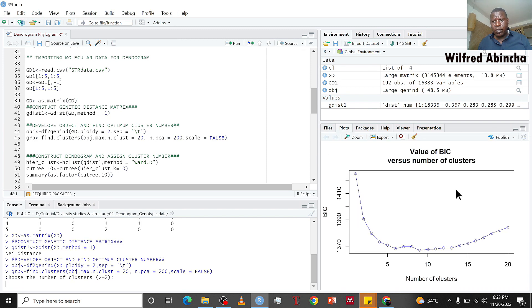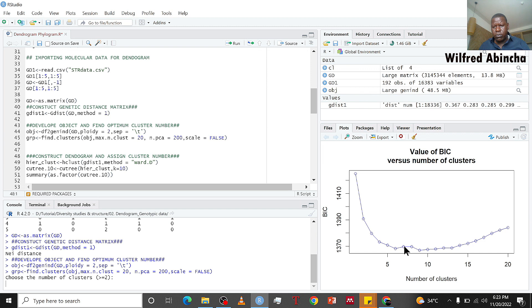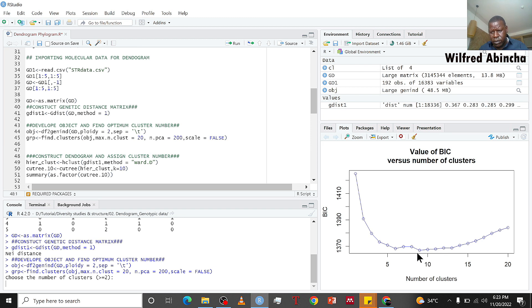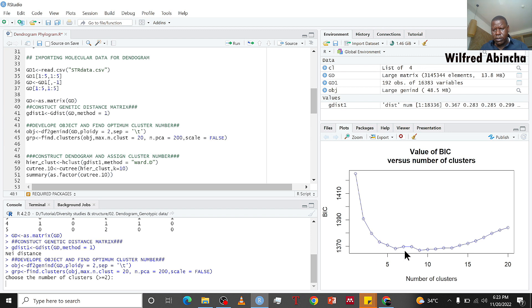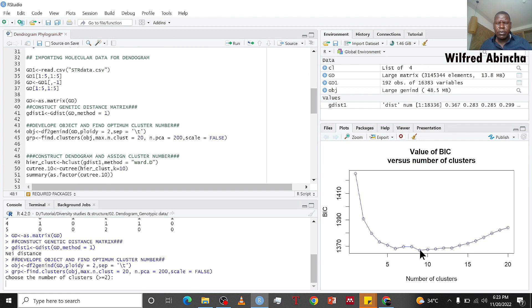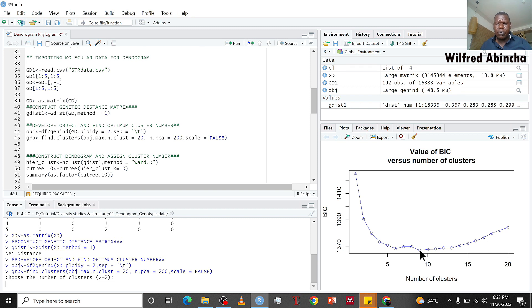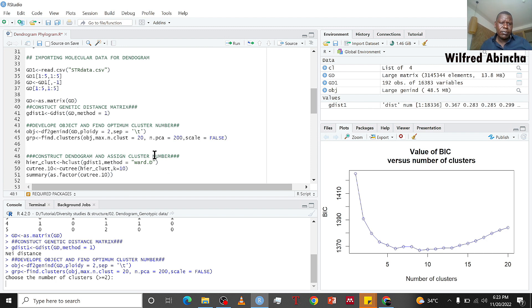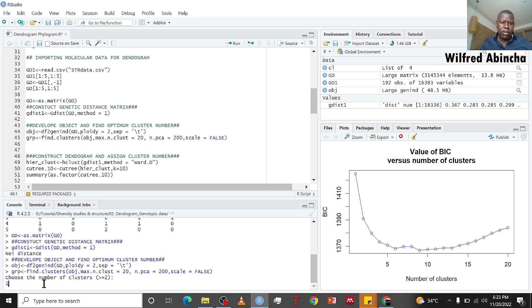From here you've got this figure and if you look carefully, the lowest BIC is found around nine. It's the smallest peak, so it means we have nine clusters that represent our data well. So you can put either nine, ten, or eight.